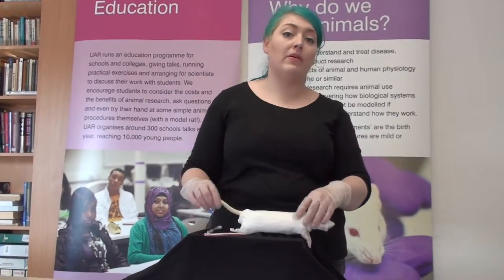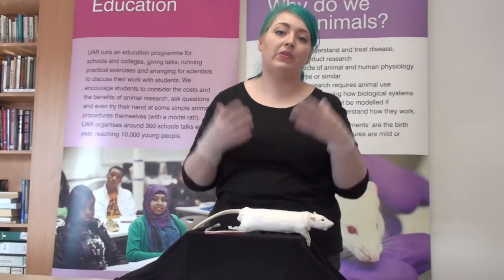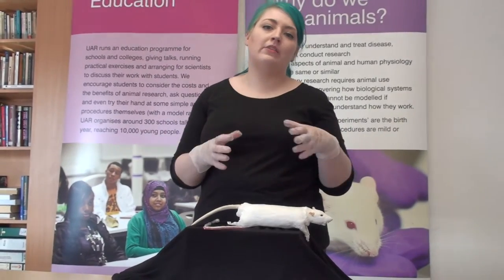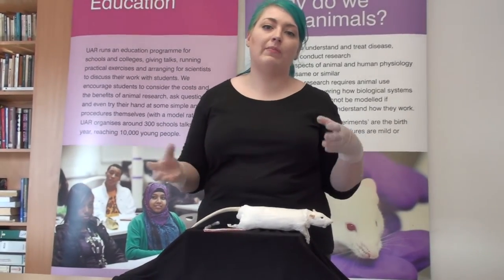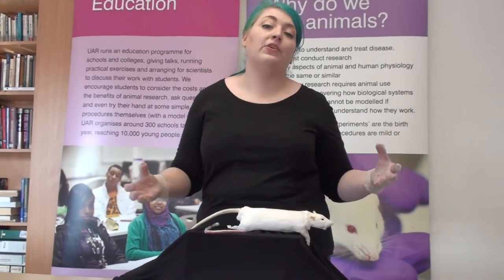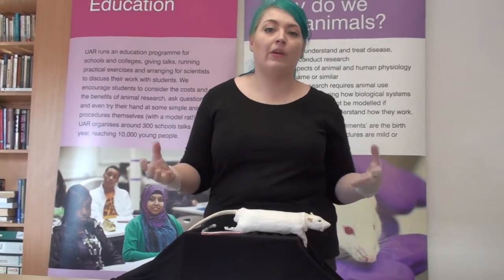Learning to draw blood from a model rat is something you would do if you were training to become an animal technician or a researcher in a lab. Before you actually start working with live animals, you need to be properly licensed, which means you're fully trained and have passed examinations to show that you know what you're doing when working with live animals.